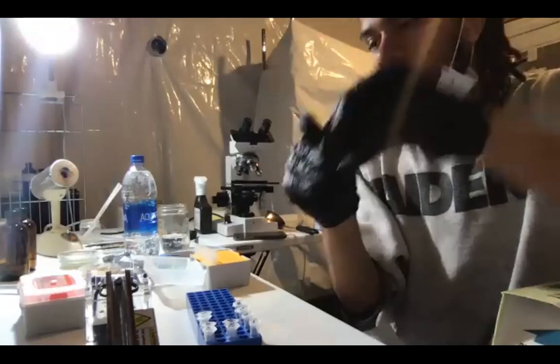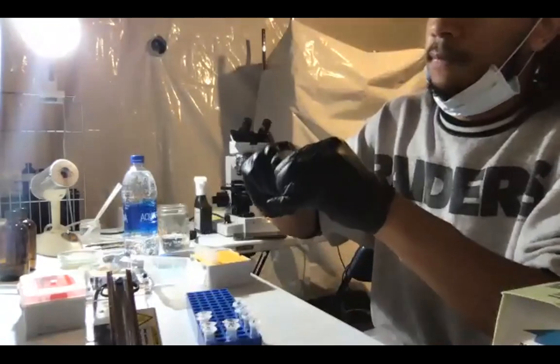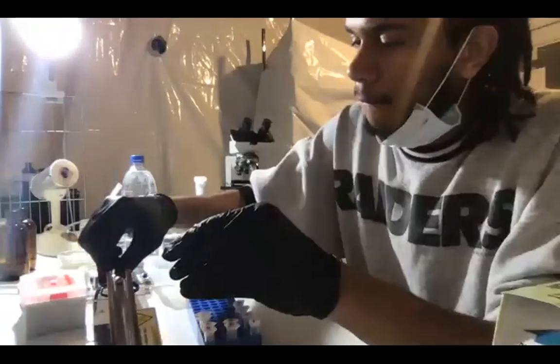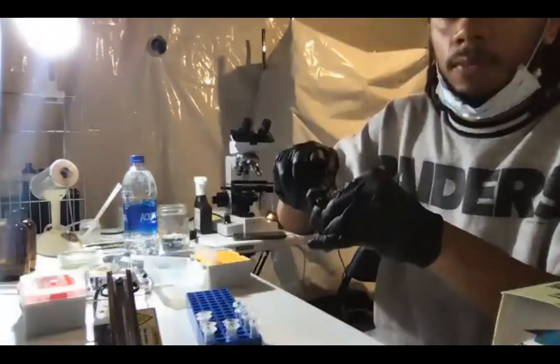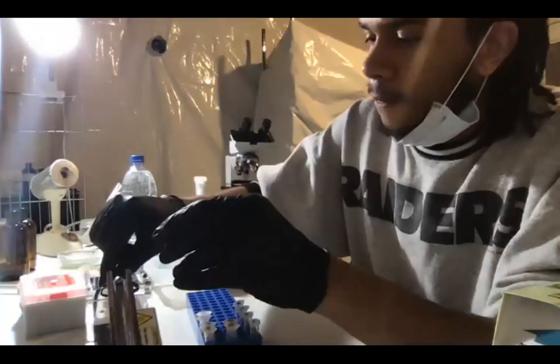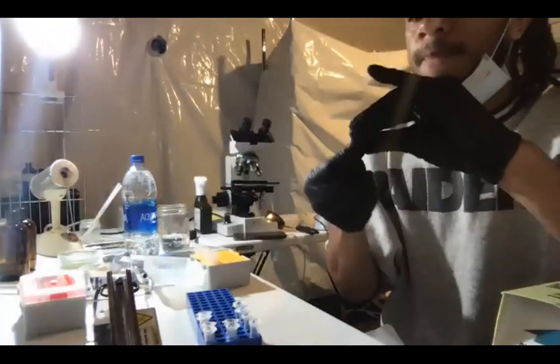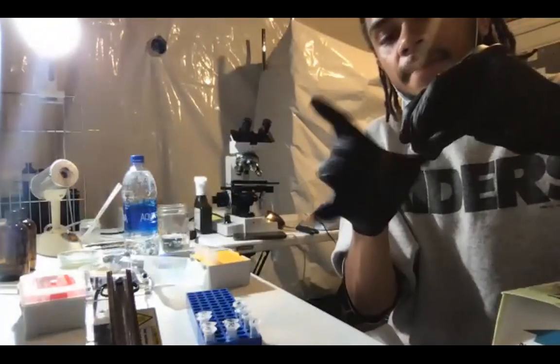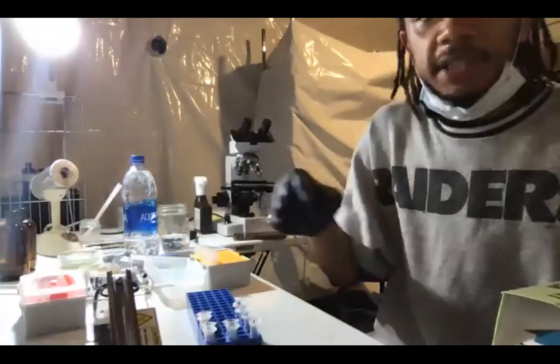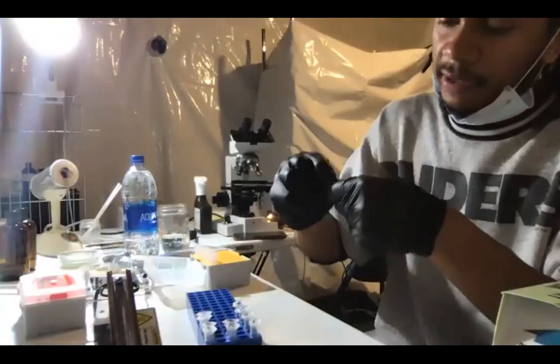just a couple times. Stick it back in and do that for each one. Make sure you put them back in the right spot, so don't take out more than one at a time. So you'll keep track of everything. If you really want to, get one of the smaller Sharpies, like the fine tip Sharpies, and mark them if you feel like you might get confused. But I haven't gotten confused yet with this.